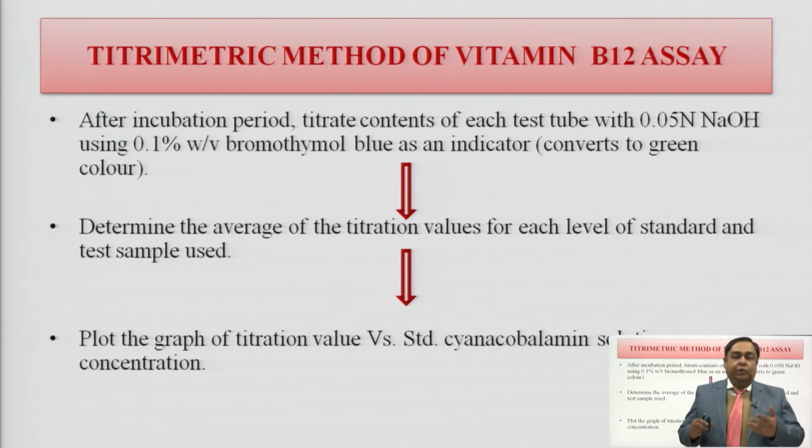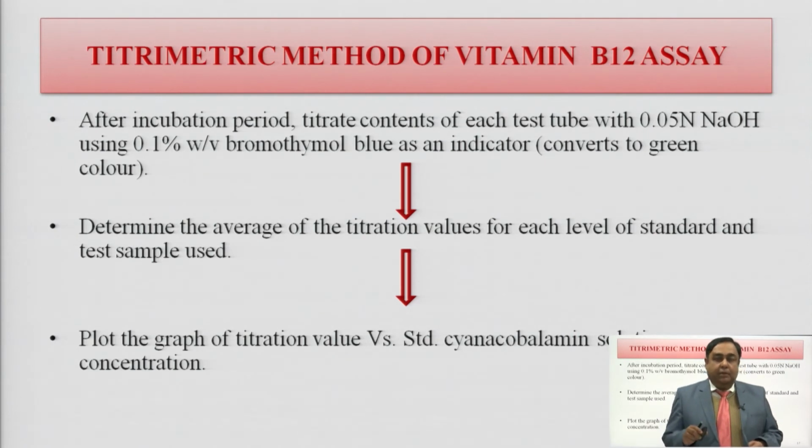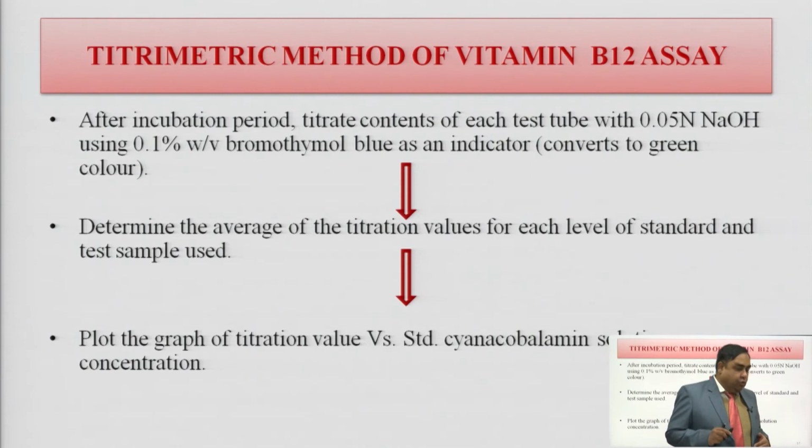So, you have to determine the average titration value for each of the standards as well as for the test sample whose concentration you want to assay.